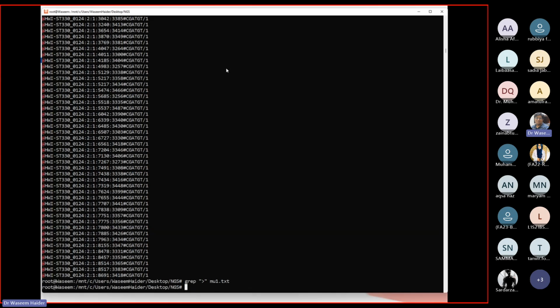I'm sorry, what was that? Grep. Yeah, so what was the name of the file? Grep. That's weird. So again, grep. What was the name of the file? Yeah, 80 transcripts, sorry, not this one. We do grep, and then on this file 80. What was that? 80 underscore transcript.